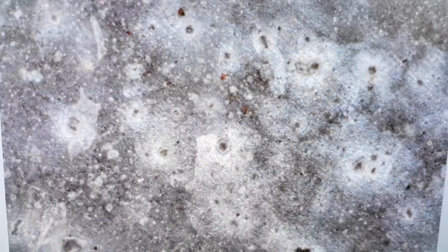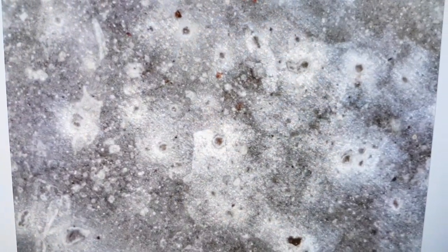If I flick to the version where polarization is turned off, you get a very different image. We'll switch back and forward so you can see the spherical structure that you can't see when looking at it the other way.